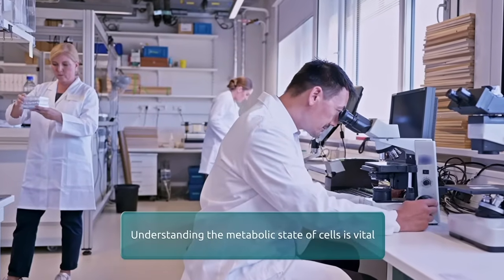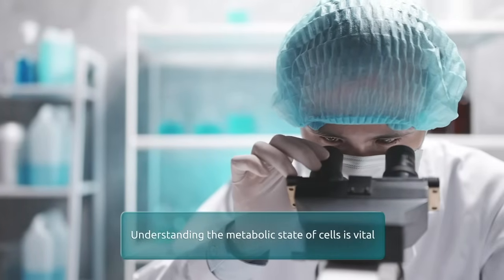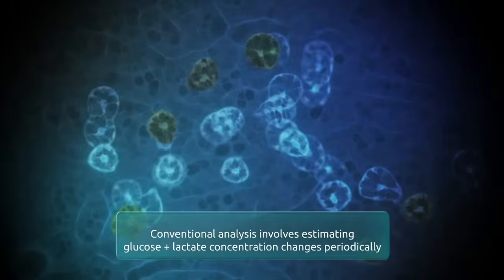Research in cancer immunology, stem cells, and cell-based formulation manufacturing all need clear understanding of cell's metabolic state.